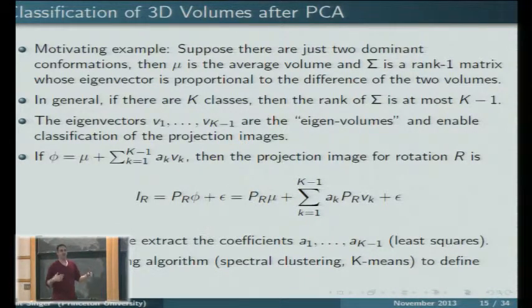So I can do k-means or spectral clustering, whatever you want. But the major step here is just to do the PCA. How can I come up with the covariance matrix? I just want us all to agree that once I have the covariance matrix and its eigenvectors, doing classification is a piece of cake. But the question is how to actually get the covariance matrix. You have a sample covariance. Right, sample covariance. You compute that, though, or do you? I have to show you how I do that.